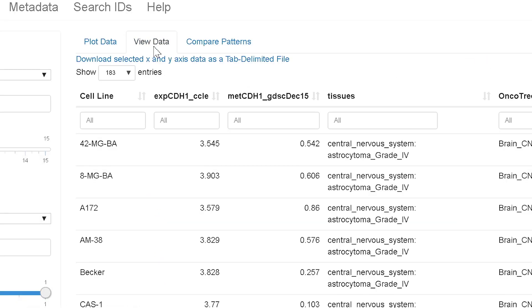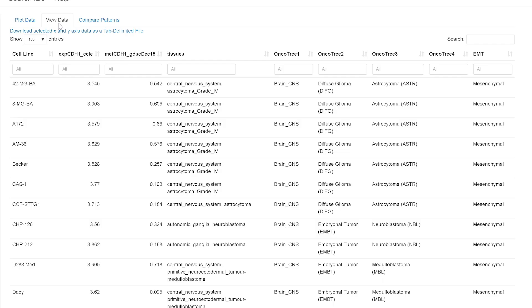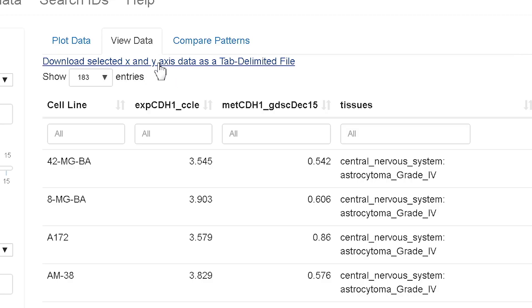For view data, it basically displays the data you've chosen in this input on the left and allows its download. So here's the download tab here.